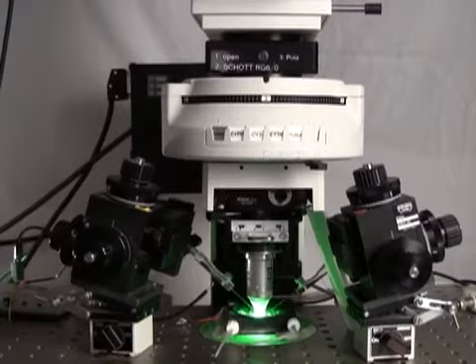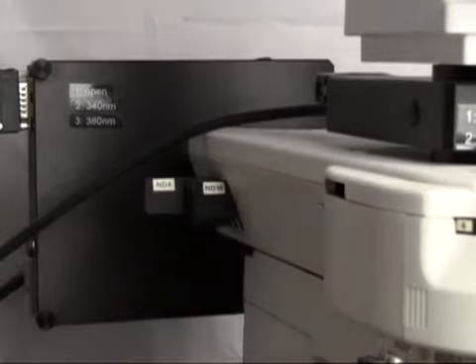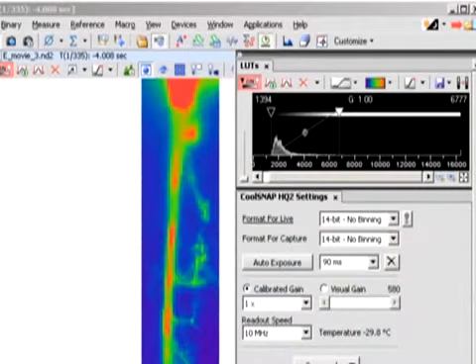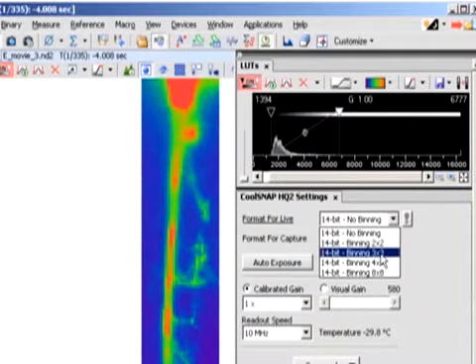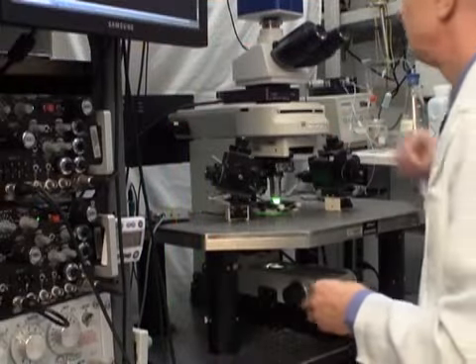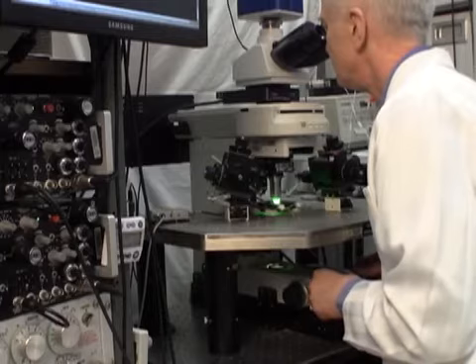Adjust the camera parameters and the illumination intensity with neutral density filters and the field aperture. More light will result in less noise, but can potentially bleach the preparation. The CoolSnap CCD camera can capture a 500 by 300 pixel field at a frame rate of around 30 frames per second and a good signal-to-noise ratio. Minimize the illumination of the dye-filled neurons by keeping the light source's shutter closed whenever possible.